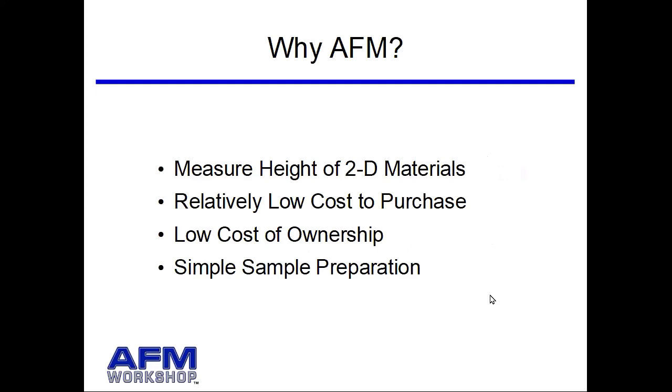So the first question people ask is, why do I need an AFM? There's a lot of other microscopes out there: optical microscopes, TEMs, SEMs. And so what sets AFM apart from those other instruments are the following items. The first thing is we can measure the height of 2D materials down to the atomic scale. And it's not very difficult once you learn how to do it.